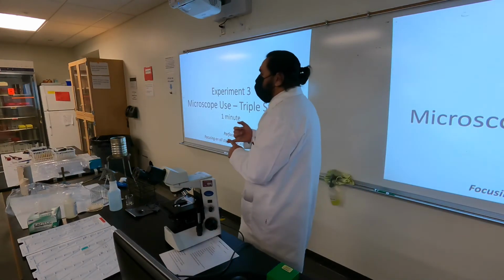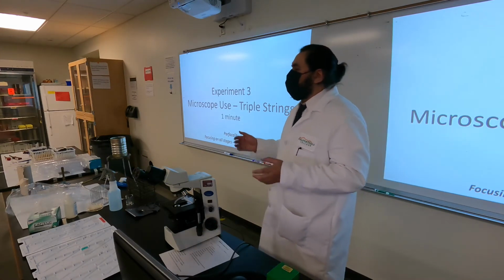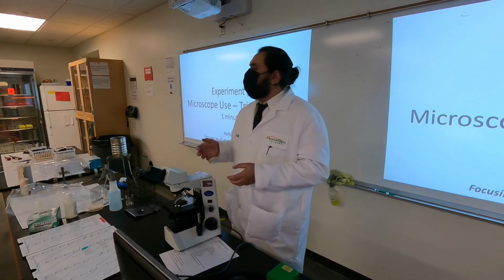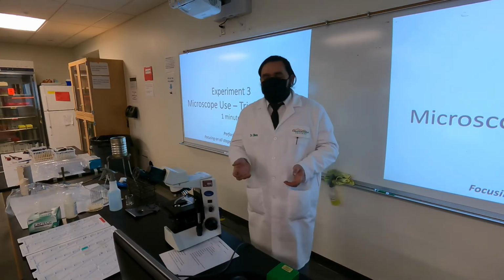Okay, so we centered it, we sharpened it, we have our three strings, we're taking a picture. So again, the picture or it didn't happen kind of idea, right? And we now need to decide which of the three strings, the yellow, the blue one, or the red one, possibly a green depending on the slide, which one is on top. Based on that, we assign your points.